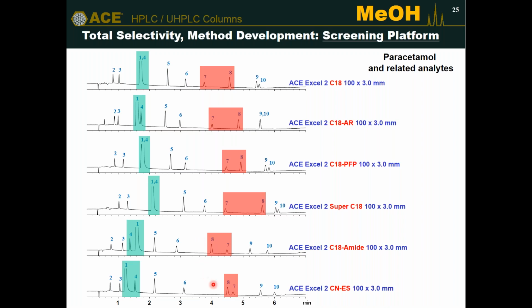And also with the stable cyano phase, the peaks are closer together, but they're still separated, but they are eluting in the reverse order. So the different column chemistry giving us a different selectivity. And then finally, peak pairs 9 and 10, we can see are slightly co-eluting, and then the last 2 phases, they are very well separated. So the different chemistries providing us with slightly different profiles and different retention and elution orders depending on the column chemistry.